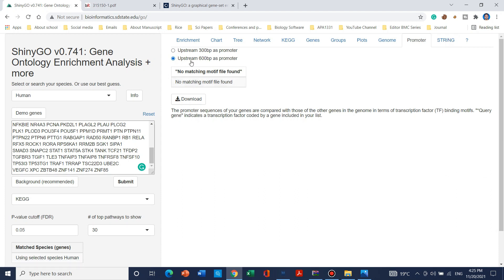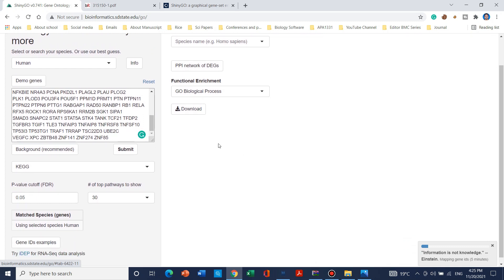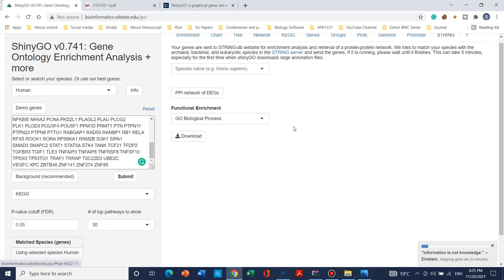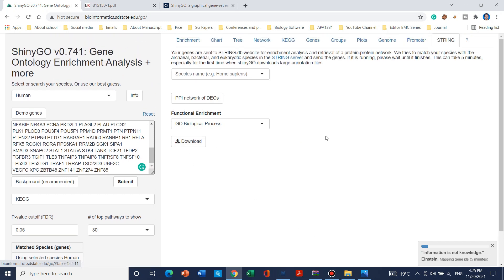If you want to use the promoter data, simply click and an Excel file will be downloaded. Clicking on STRING — which is a protein-protein interaction network tool — will take a few minutes to upload a new table of the protein-protein interaction network for the differentially expressed genes. After the table appears, you can click and download it.